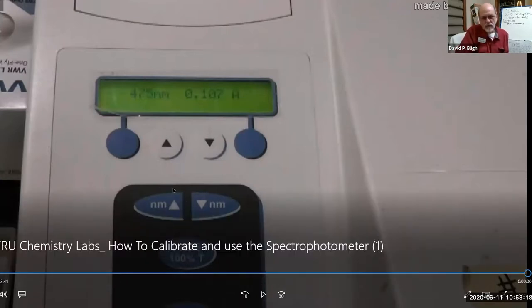So when they were pointing to the NM, that stands for nanometers, right? So that's the wavelength at which the instrument is reading the absorbance. Your wavelength is going to be 630 nanometers, and that's in the method, and I've written it on the whiteboard here for further discussion.